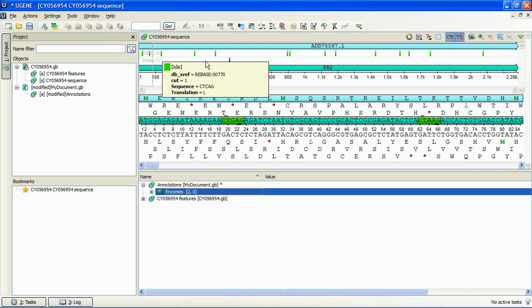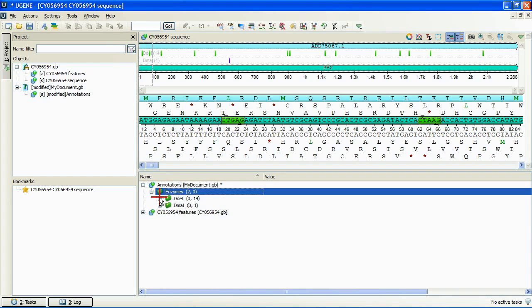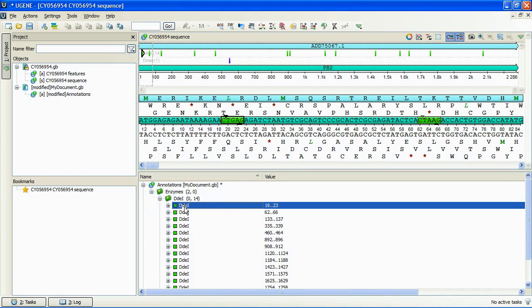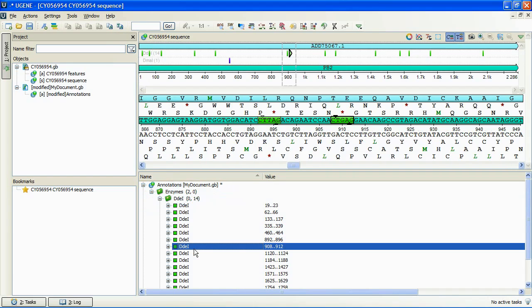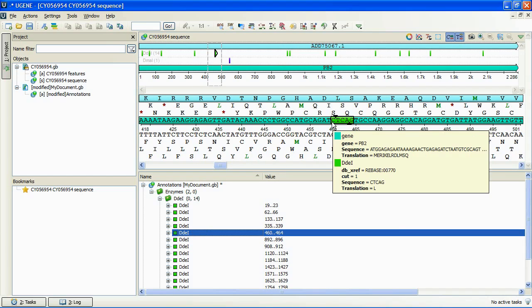Let's select some enzyme from the Annotations Editor. We can see it selected at both Panoramic and Detailed view. We also see two triangles near it at the Detailed view. They represent the enzyme cut sites.